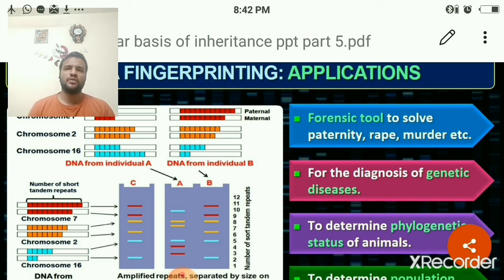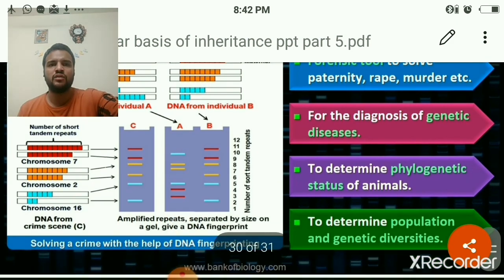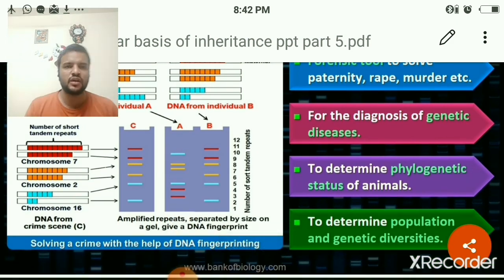If the patterns are resembling, then you can conclude that this species is related to that particular sample, and they are closely related species. Or these two closely related species may have a common ancestor. Like that we can study evolution. Next, we can also use it to determine population genetic diversities with the DNA fingerprinting technique.